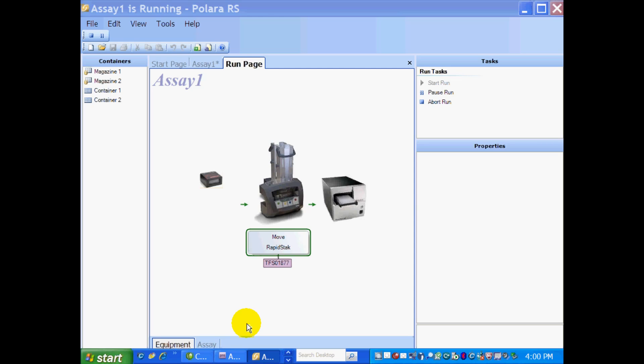So now you see Container 1 has been given a barcode read, and it's taken over to the Eon Reader. And you can see it's going to run its program on the Eon. And it's simple as that.